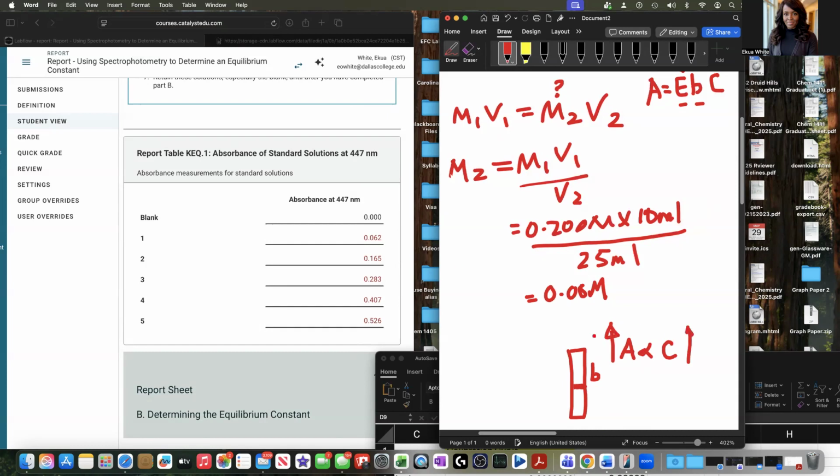If there is a relationship between these two, then if we know the absorbance, we can mathematically figure out the concentration. Let me give you the bottom line. Why are we using this machine to find the absorbance? We don't really care about the absorbance. It's just a means to an end. What we really want is the concentration. Do we have a concentrationometer in the lab? I just made that word up. No, we don't. We don't have a device that directly measures the concentration.